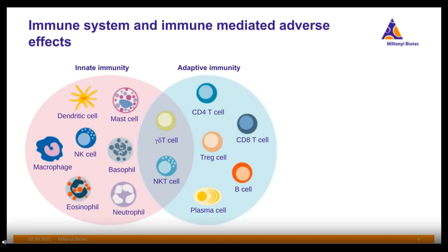As you all know, a significant number of drug candidates fail in clinical trials due to safety issues. Drug safety assessment, therefore, is a very important battle to ensure successful development of a therapeutic candidate. Interestingly, the immune system was not often considered for safety pharmacology studies. With an increasing number of immunomodulatory drugs, unwanted immune responses were also more evident.